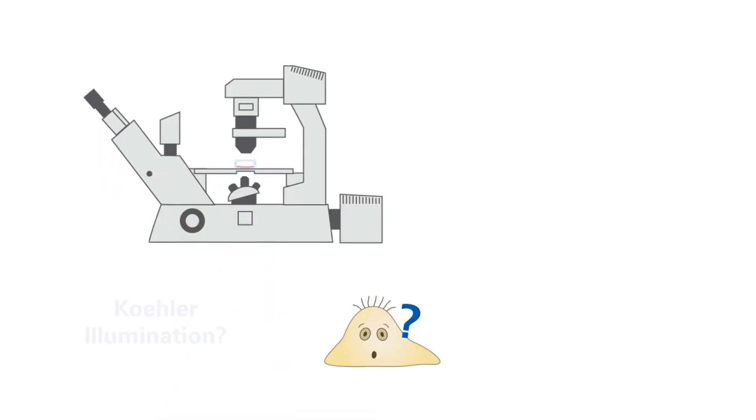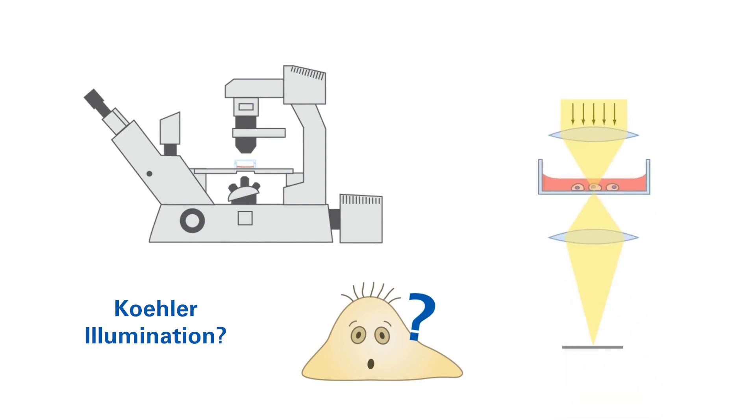Do your microscopy images have low contrast, are unevenly illuminated, or not well-focused? This might be due to lack of correct Kohler illumination. Follow the next steps to set up Kohler illumination in Brightfield Microscopy and improve your images.